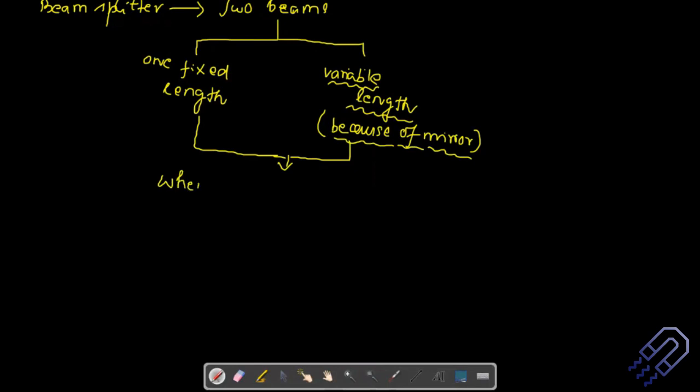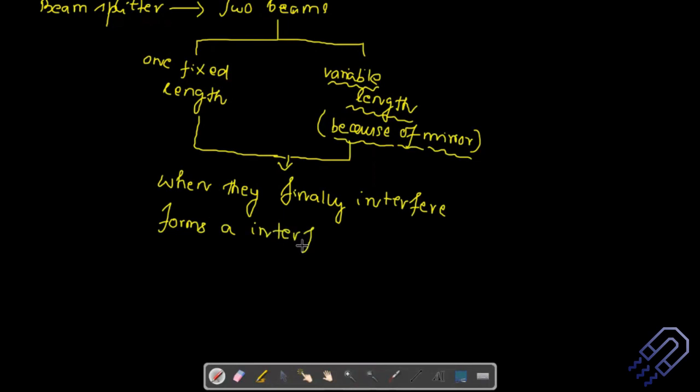You can use a similar idea to write it down in your exam. When they finally meet, in optical terms we say they interfere. When they interfere, we get something called an interferogram. You will have constructive interference and destructive interference, and based on this you are going to get a spectrum. But this is the term. The question would be, what is an interferogram? For 2 marks probably.